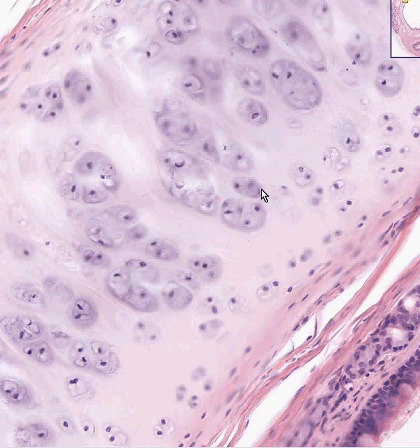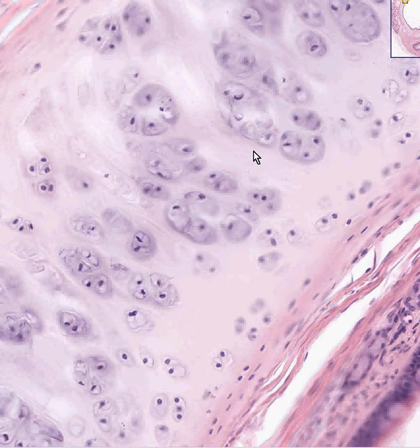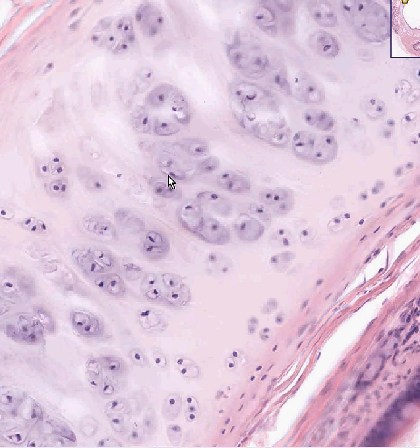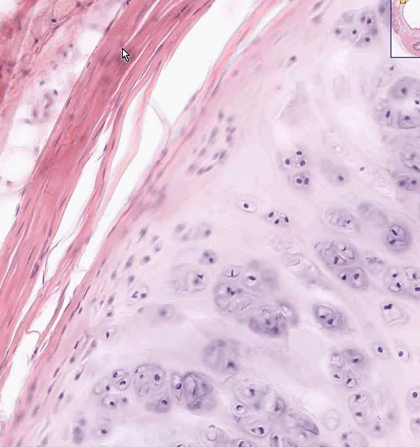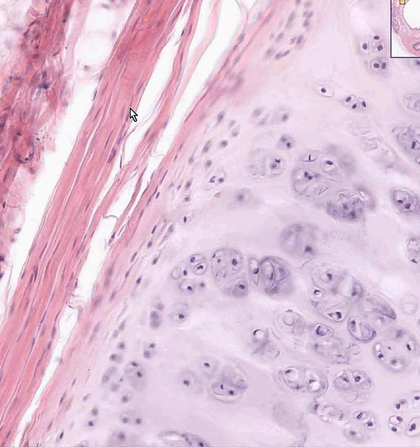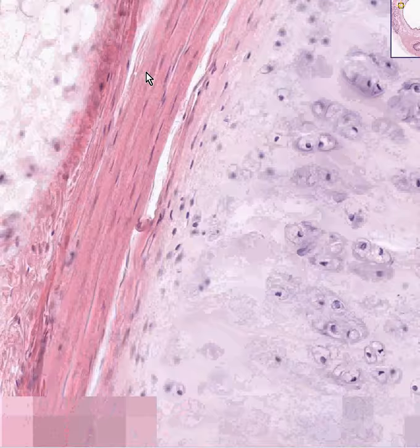We have classical hyaline looking cartilage here, but technically if we did an elastic stain and there were a lot of elastic fibers and we didn't know this was trachea, you have to remember that elastic cartilage looks exactly like hyaline cartilage unless you do a stain for elastic fibers. And now we have some more fibrous connective tissue or smooth muscle actually at the edge of this trachea because they have long spindly cigar-shaped nuclei in which there are no striations.